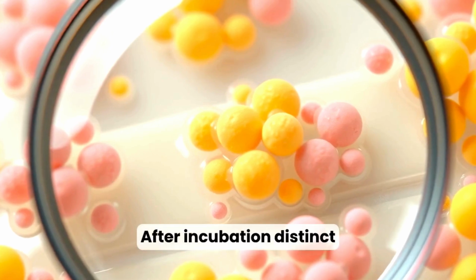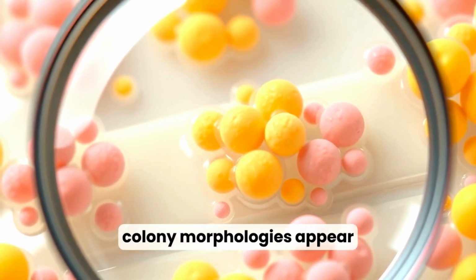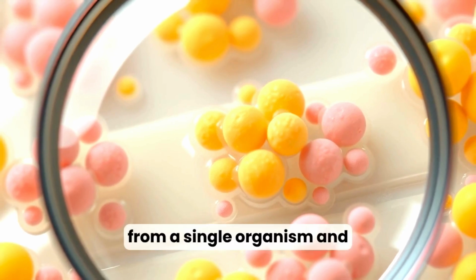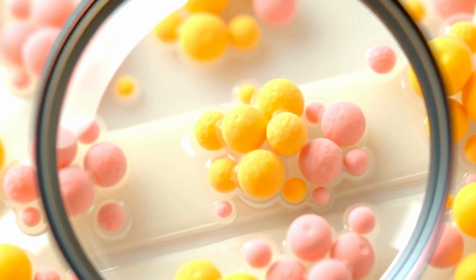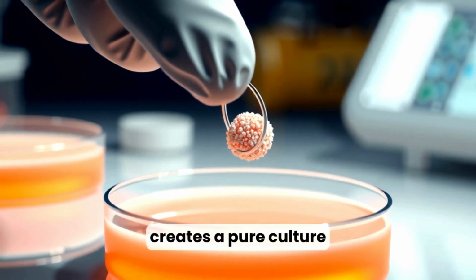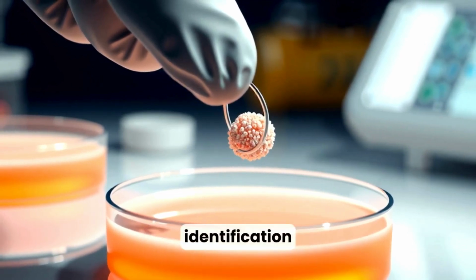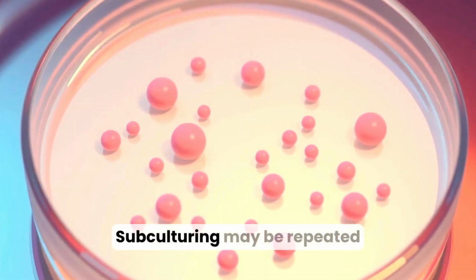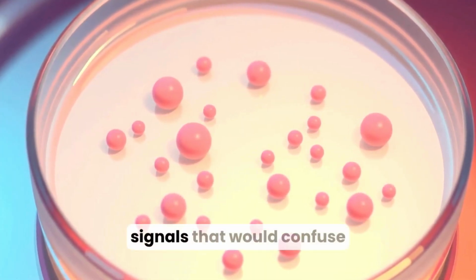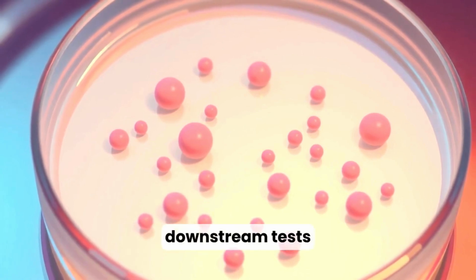After incubation, distinct colony morphologies appear. Each colony ideally originates from a single organism and represents a pure type. Picking a single colony and streaking it onto fresh media creates a pure culture necessary for accurate identification. Subculturing may be repeated to confirm purity. Pure cultures eliminate mixed signals that would confuse downstream tests.